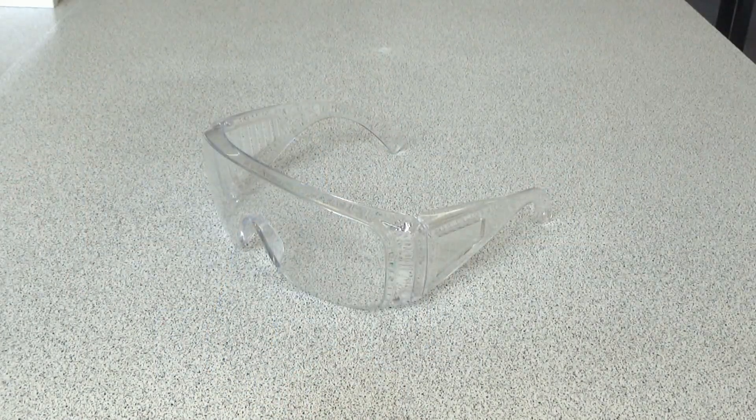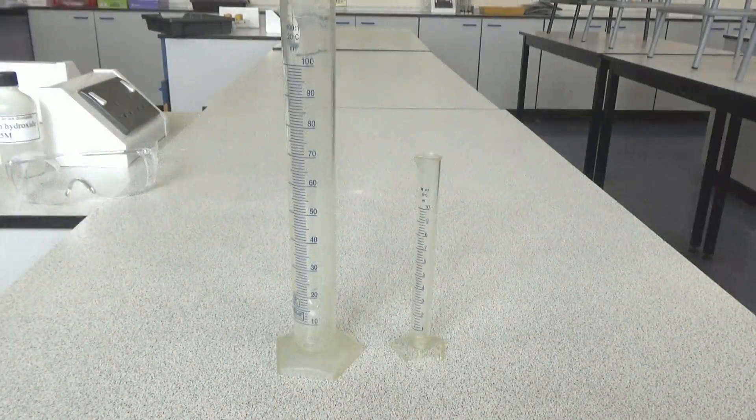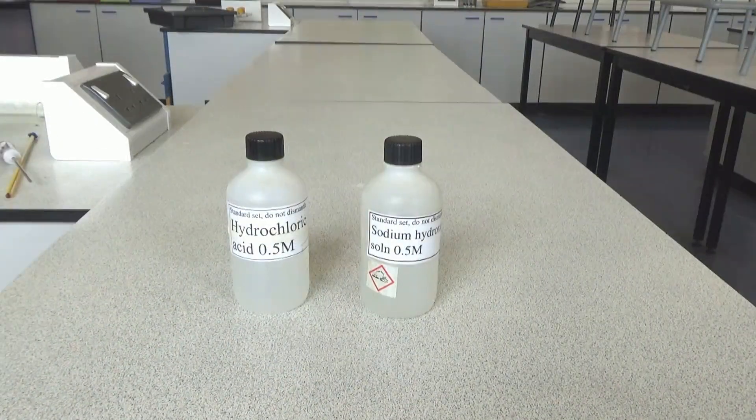To carry out this practical you'll need some safety glasses and measuring cylinders. The reactants we'll be using are hydrochloric acid and sodium hydroxide. The instructions often say use a concentration of 2 mol/dm³, but I'm only using 0.5 mol/dm³ because that's much safer and it will still give good results.